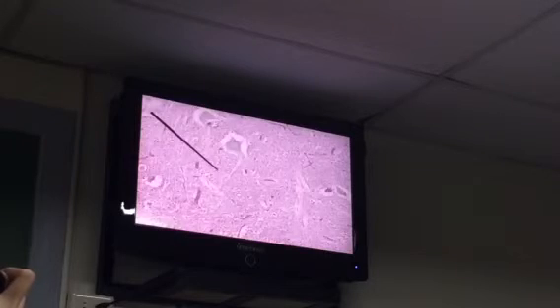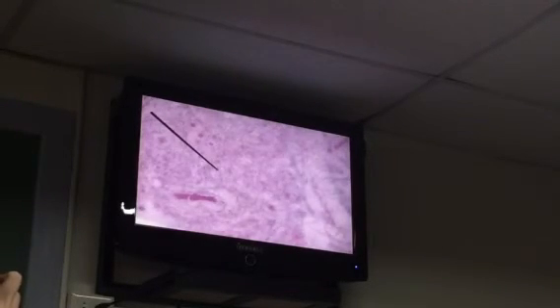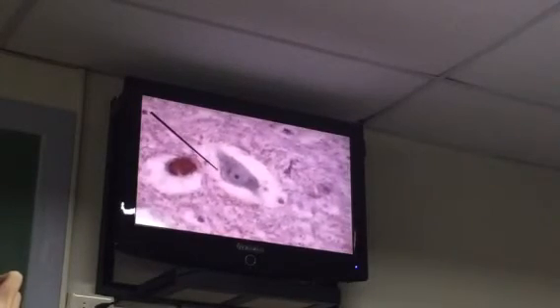And if you remember, we saw nerve cells as being stellate shaped. So look at this. This is a stellate shaped neuron. Ayan po. And if you remember, these are cells that are arranged haphazard or at random. This is high power. So again, there you go, that's your nerve cell, another nerve cell over here.